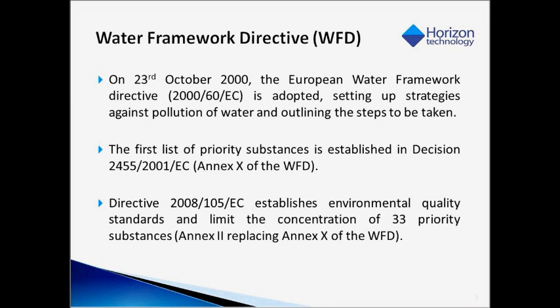The Water Framework Directive was adopted in 2000 to monitor water pollution. And this is water in lakes, in rivers, and groundwater, and every kind of water. So it's called whole water. So this European standard is about whole water.